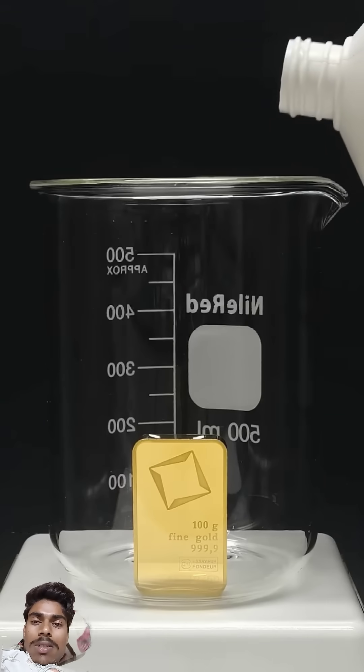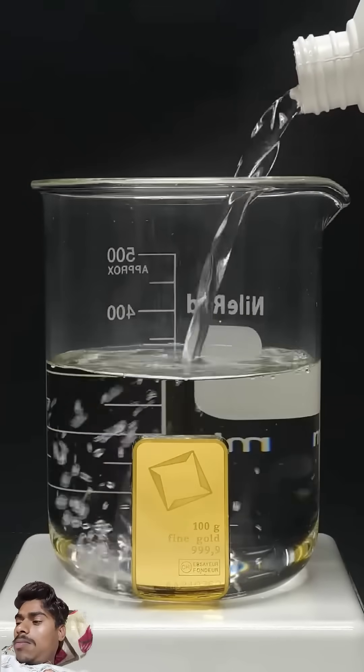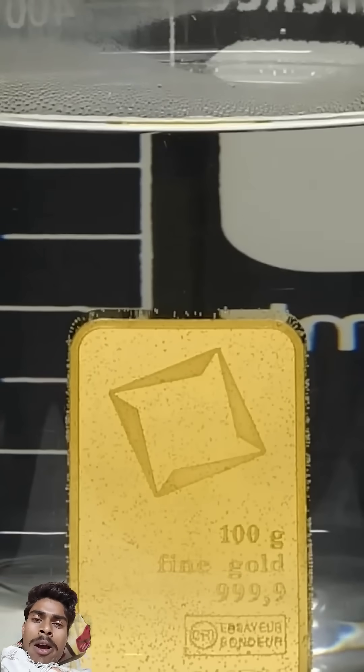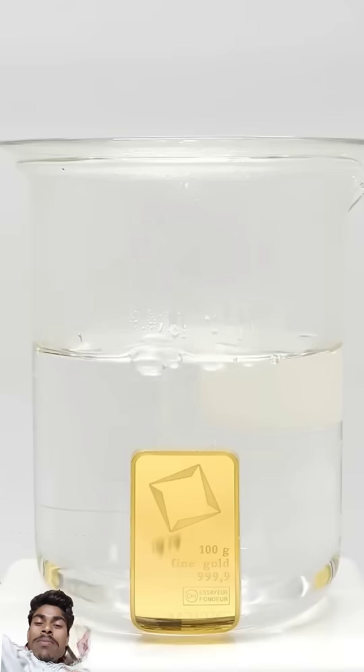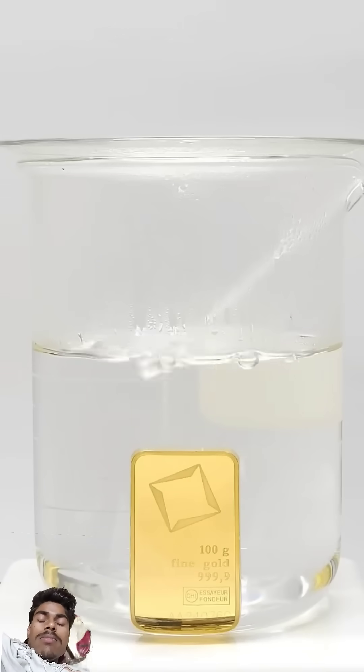All I have to do is pour in a bunch of concentrated hydrochloric acid and I'll bring this to a boil. Right now, not much is happening, so I have to add some nitric acid.